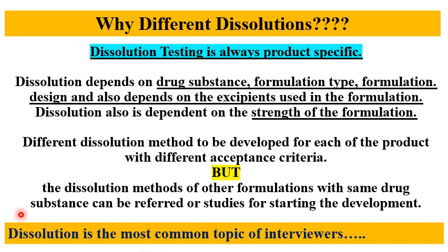We cannot test different products with the same method, or give the same acceptance criteria for dissolution for different products. The dissolution method of other formulations with the same drug substance can be referred to or studied for starting the development.